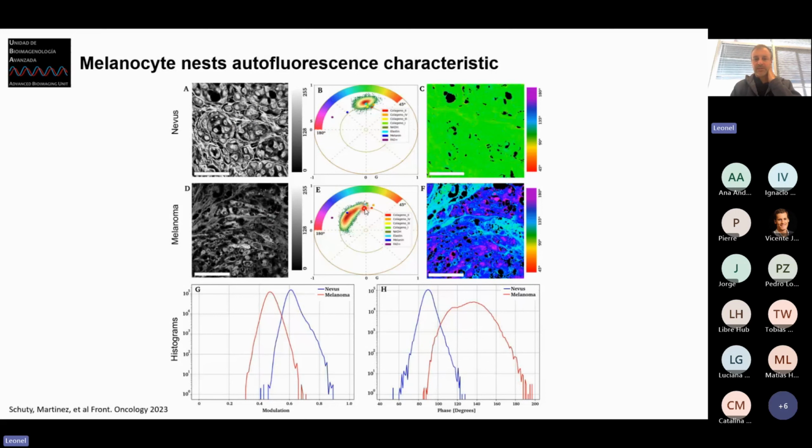There is also melanin here, and there is a component that we cannot identify, but we speculated that it can be a different oxidative state of the melanin, because there are different oxidations of melanin, and we are now working on understanding this. We are trying to produce this melanin in a synthetic way to see if we can give a name to this composition here. But in any case, we were successful in determining the components and the role of these different things.